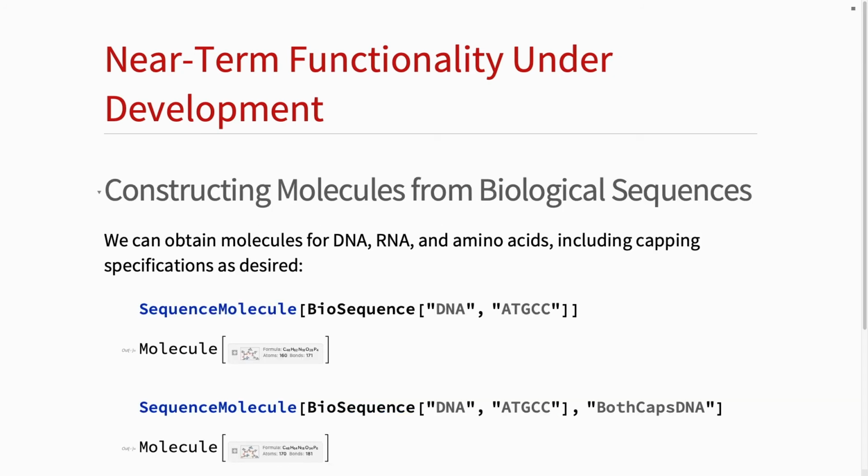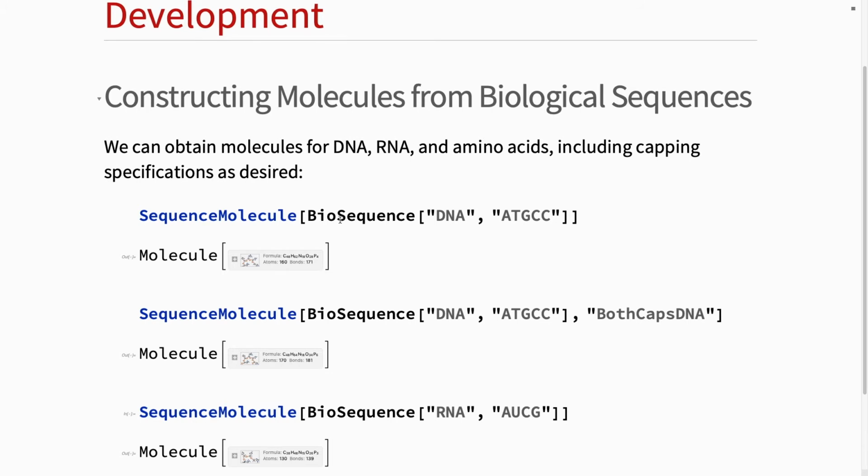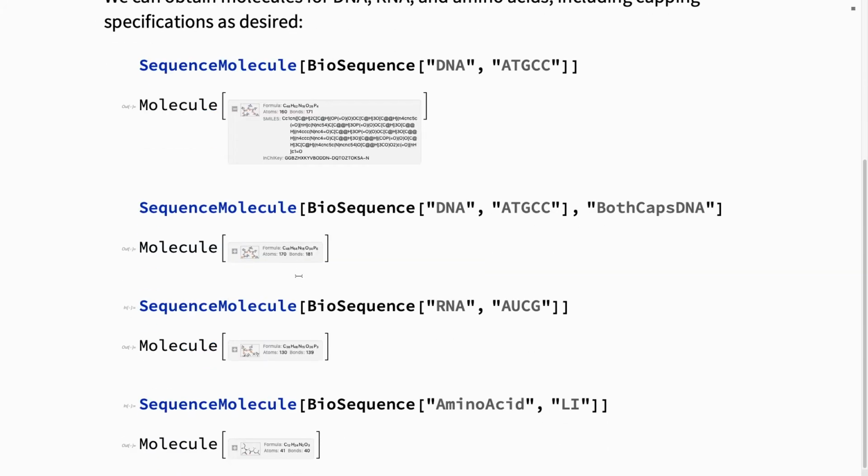We also have some support with molecule. The chemistry developers will be exposing this sequence molecule here eventually. And with that, we can give them biosequences and translate them into the underlying molecule, and then all of the chemistry functionality will also apply.